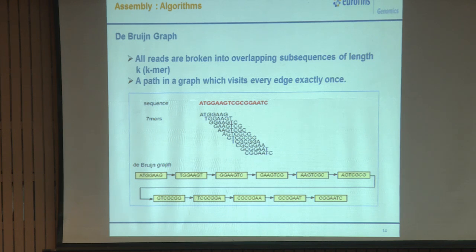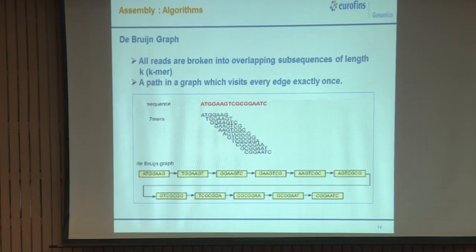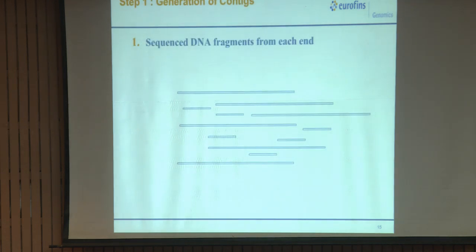Each and every sequence will get matched to each and every sequence of the other. Just imagine how many. This way the de Bruijn graph is created, and based on this the overlap of sequences gets attached to each other, and when that happens it creates a contig, right. So, this is how contigs are created using several softwares.